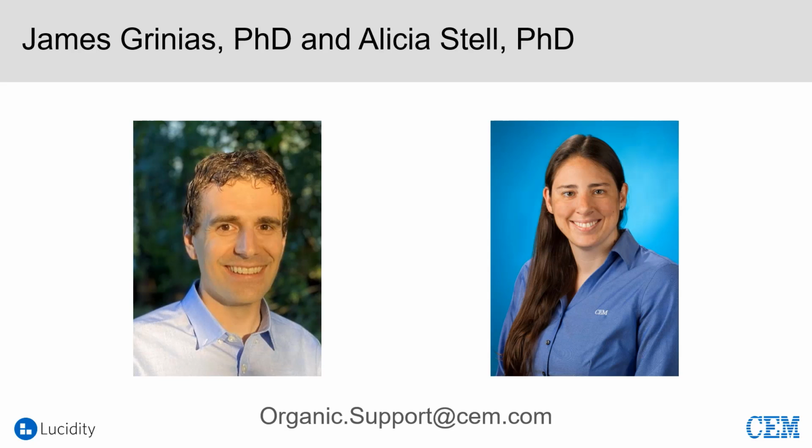We've also done a lot of fundamental work using a set of standard alkyl phenols that people use for general performance testing and column testing. I know that there are a lot of other application notes that are available on the Lucidity miniLC website, so maybe I'll turn it over to Alicia briefly to mention some of the other applications that they've been working on down at Lucidity. Yeah, thank you, Jim. Yeah, for those listening, you can go to luciditysystems.com and go to the application page and see kind of the stuff that we're working on.